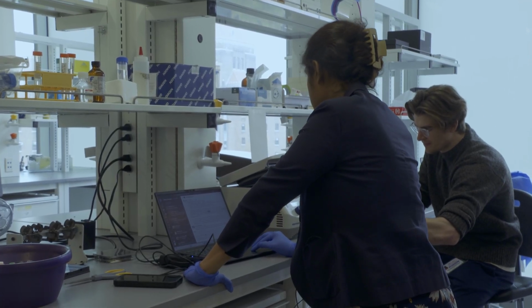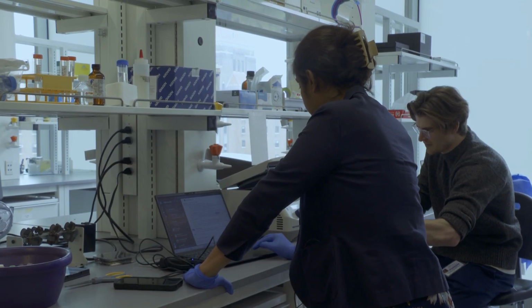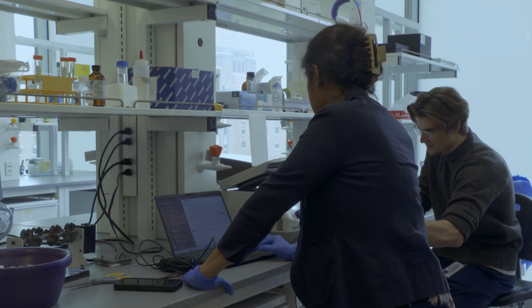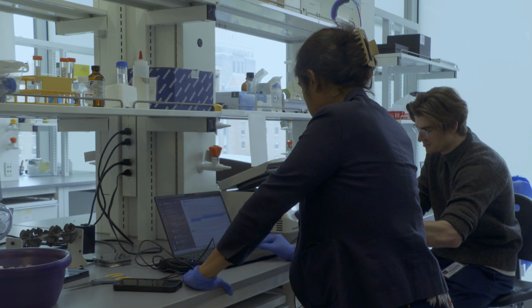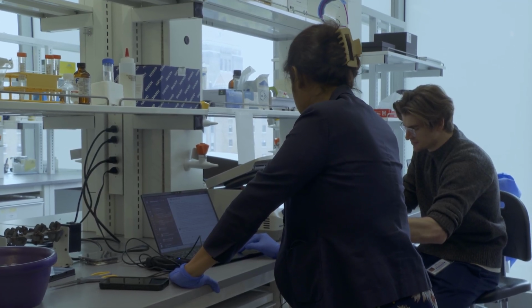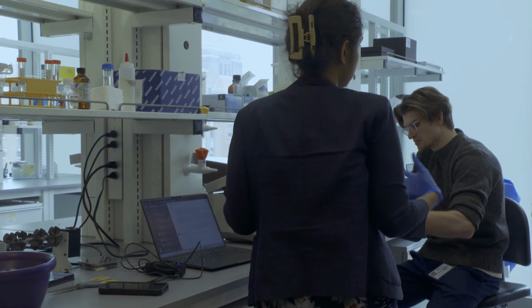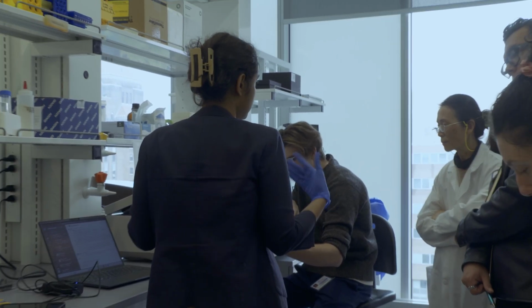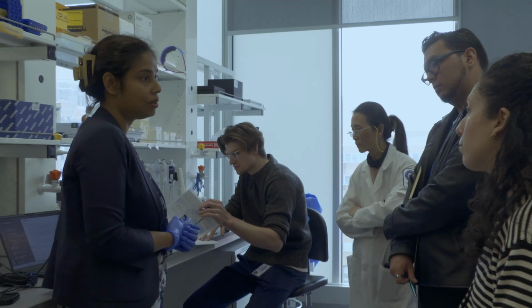260 over 280 was 1.7 to 2.4, and 260 over 230, 0.4 to 1. Even with this range, what happens, let's say you have some contaminant present? It is for the library prep step, which is the attachment of the adapter. It might hinder it.